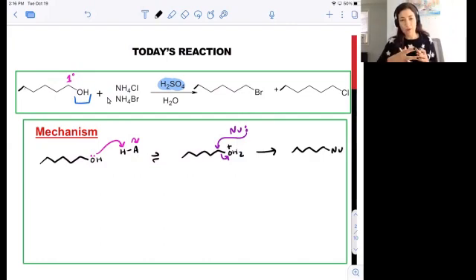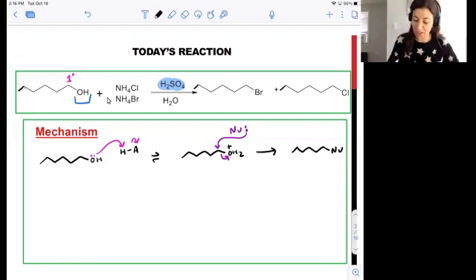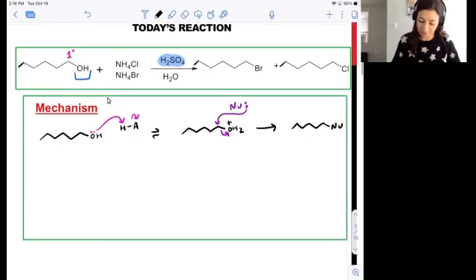When you think about whether you expect chloride or bromide to be the stronger, winning nucleophile, consider the whole set of reaction conditions and maybe think about some of the trends you've learned in lecture. Come up with a hypothesis, and you'll be able to tell if your hypothesis was correct when you analyze your data.